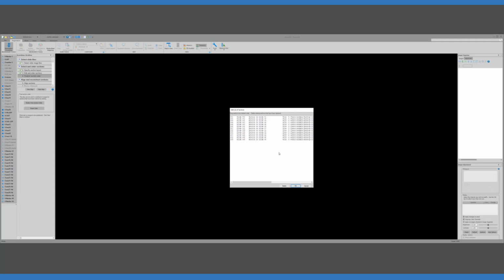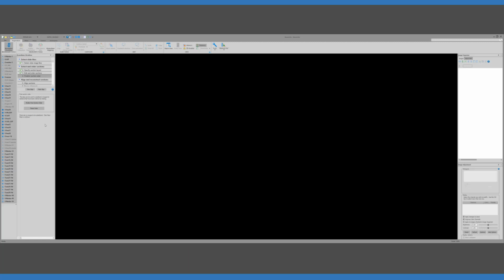Again, this is something that's available. It requires a little bit more description of how to do that. Again, the excellent people at MVF can help with that. Those are all in order. So now that the sections have been selected, outlined, and put in order, we go on to the next step.